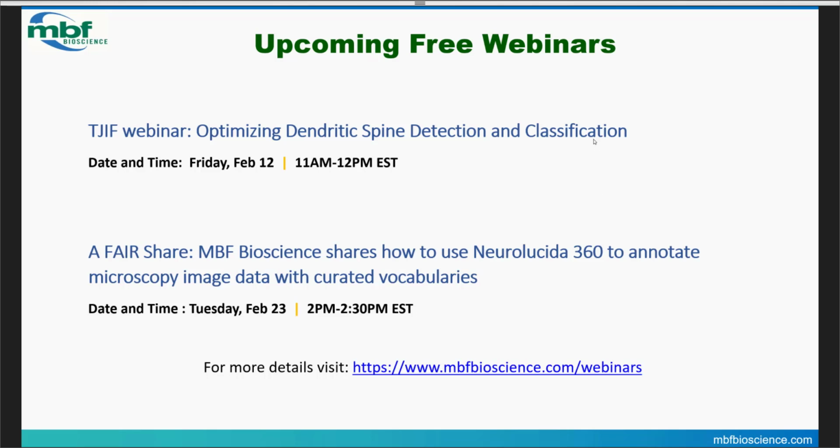I think I can try to tackle that one. It would depend a little bit on what type of distortions are present. I'm not familiar with that type of mutant, so that's where we can dig in a little more. We might want to consider doing a webinar on pathologies. I think that would be really interesting. The nonlinear registration that we do can sometimes address those issues, and we find that that's sometimes sufficient.